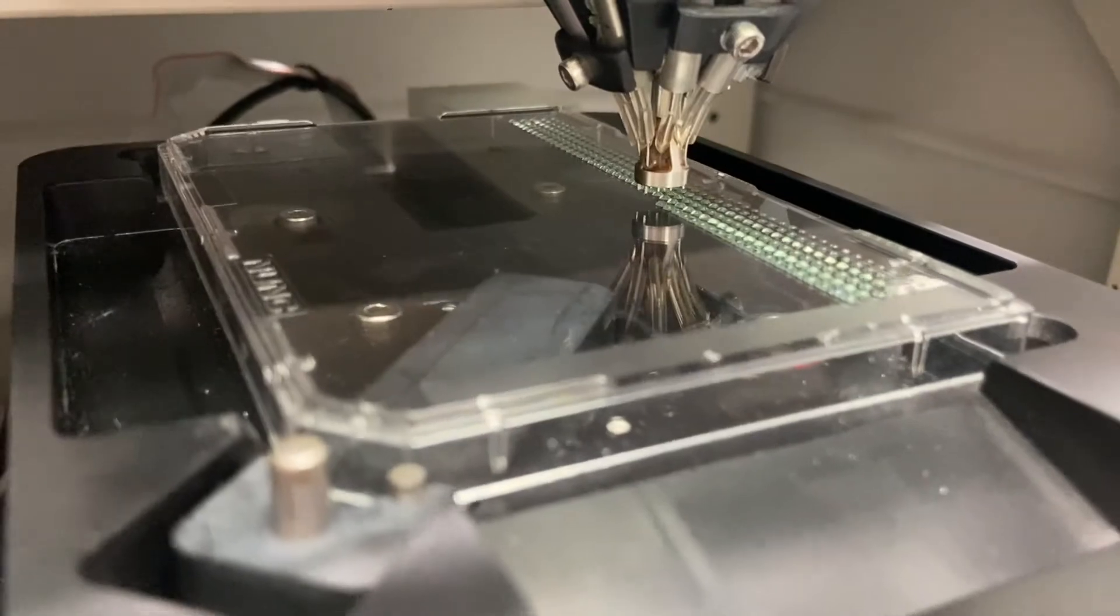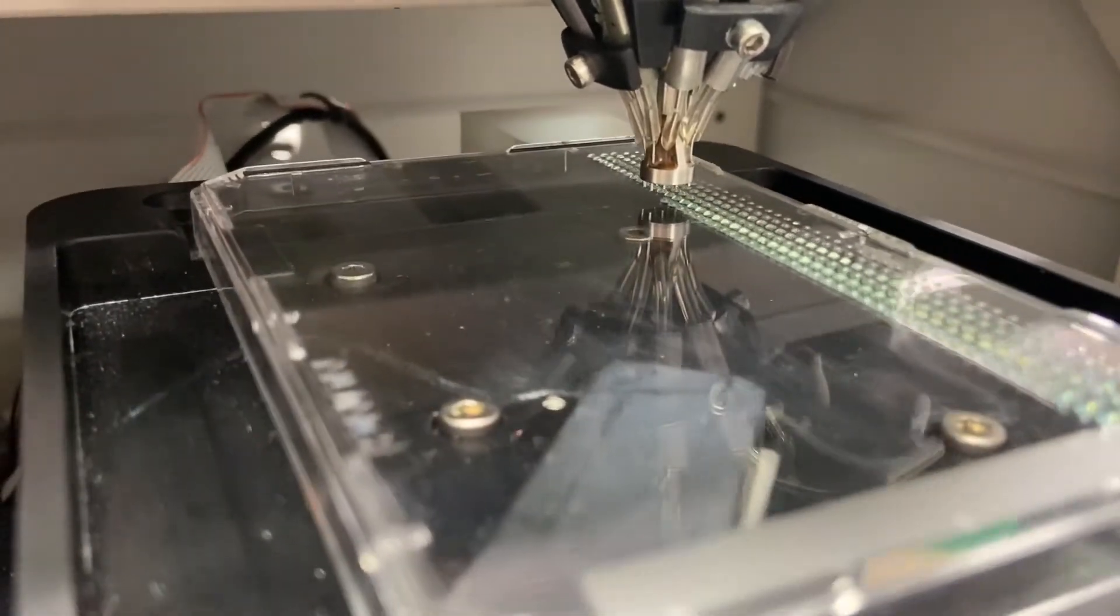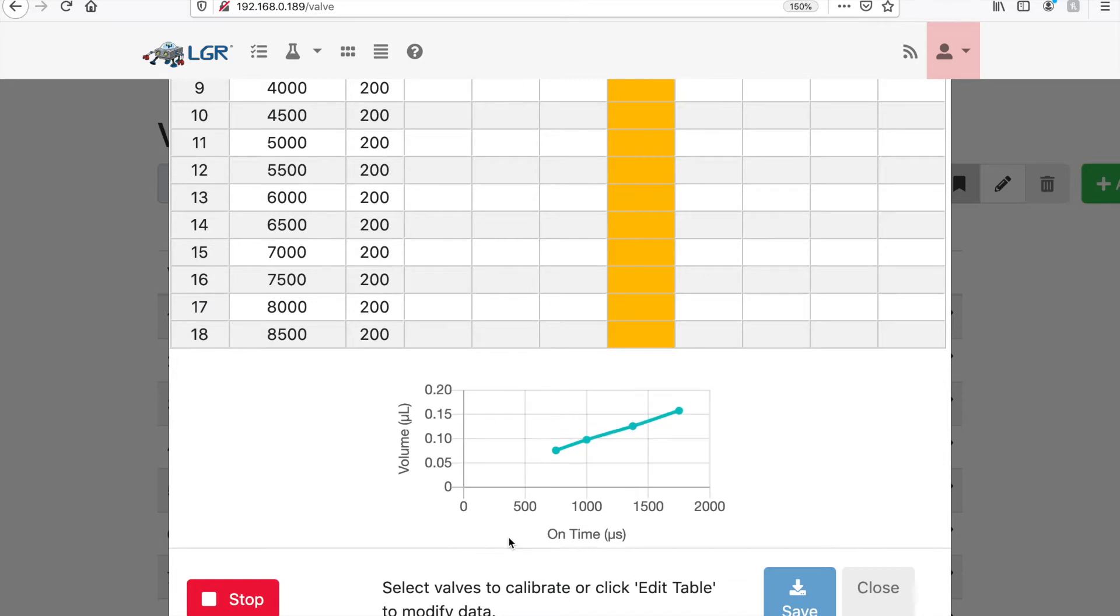The droplet volume size ranges from 50 nanoliters to 100 microliters, with a full calibration curve on the valves.